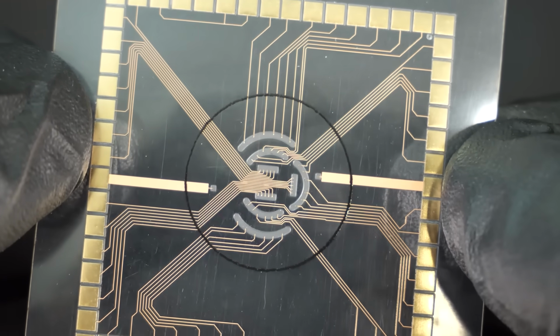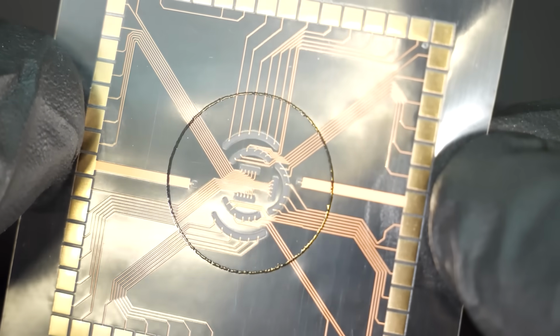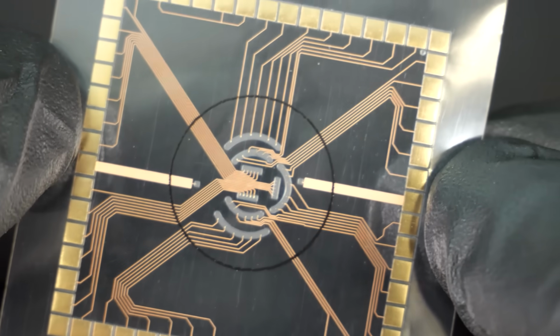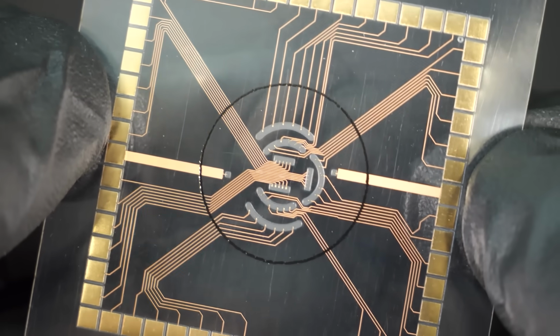Unlike the commercial electrodes, ours are laid out specifically to eventually play a video game with neurons. As such, the electrodes are larger and spaced much further apart, so it'll be interesting to see how Jerry behaves on each array.